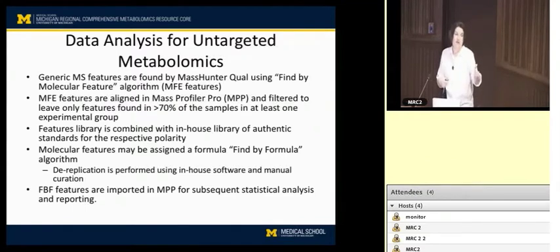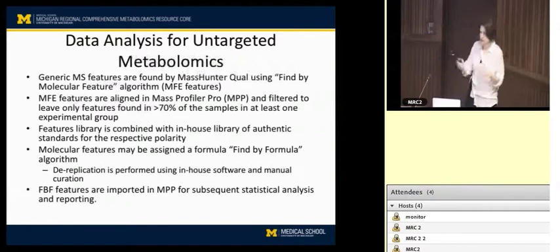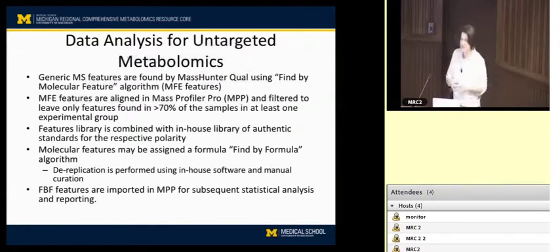So to answer your question, I don't think there's enough data out there yet, because it's only really worked on these large batches that we've been looking at for the last 6 months, to say whether there's enough of a difference between ProFinder and the original batch recursion to say whether one's superior to the other at this point. But that does bring up that we're talking about Agilent software, which most of you are not going to use. So there are differences in the software that's out there.